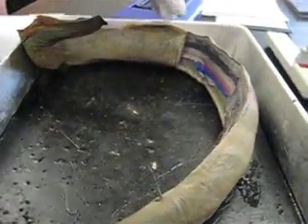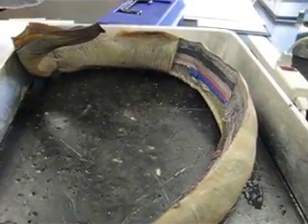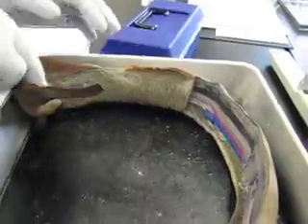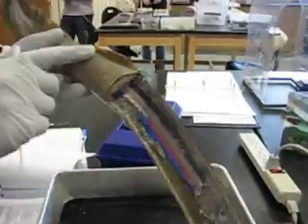We have the main trunk of the fish. We have paired dorsal fins. We'll have a caudal fin, and if you looked up into the light you could see the fin rays.